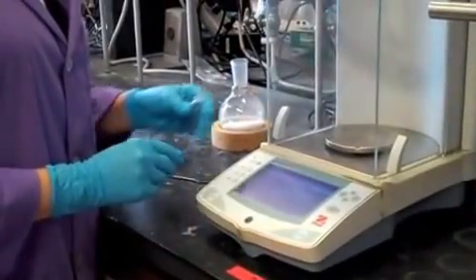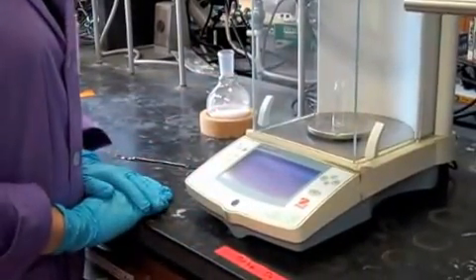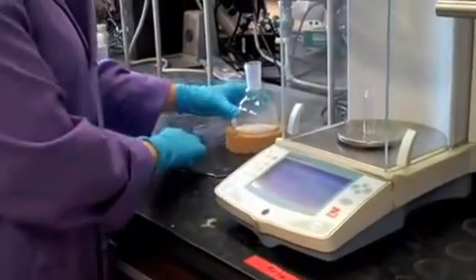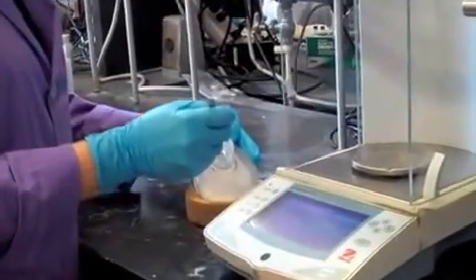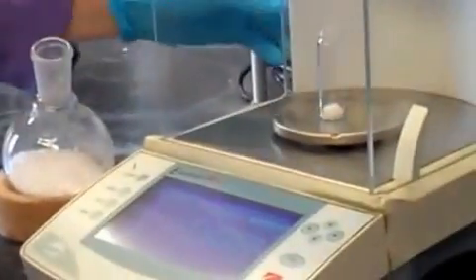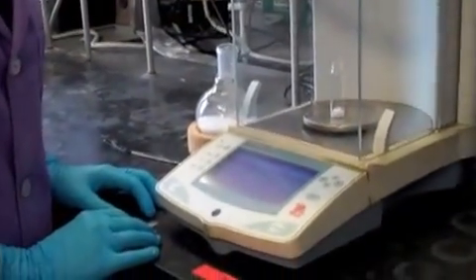Once the vial has cooled, we'll weigh out our sample of N-pivaloyl o-toluidine. First, tare the vial, and the N-pivaloyl o-toluidine can be weighed out directly into the vial. Our sample weighs 113 milligrams.